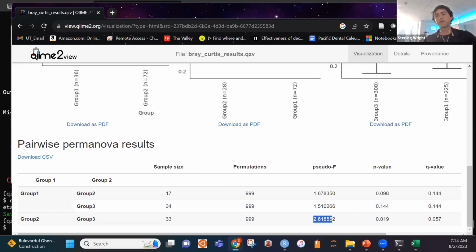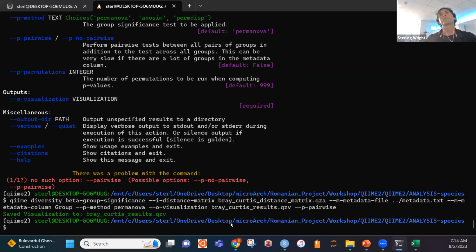All right, I'm just going to try to keep going. So that's beta diversity. We can also look at alpha diversity.